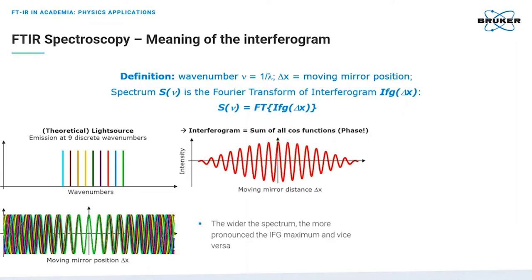in a peak in the middle of the overall interferogram, where all components have a maximum, and into wings of the interferogram, where the intensity decreases more and more. Now we can imagine the following rule of thumb. The broader the light spectrum is, the more we have a well-defined center burst together with decreasing intensity in the wings.